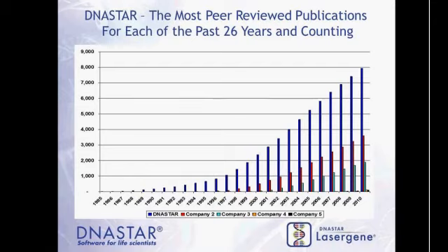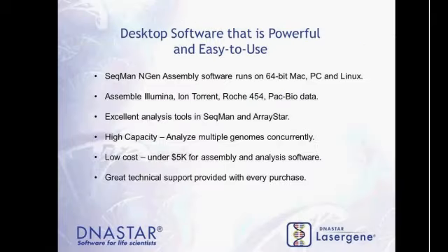We've since then added additional tools. So if you're joining us today and you're an existing customer and you have Lasergene software, we will be discussing some of the new software that you can add to incorporate some of the new sequencing technologies. So our software, again, it's desktop, it's powerful, and it's easy to use, and that's really what our goal is.